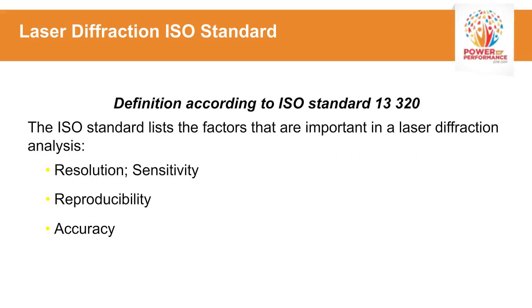Brief discussion on ISO standards. ISO standard 13320 discusses some key factors that are important for laser diffraction that one wants to consider in their design. ISO took these into consideration. So resolution and sensitivity of the result. In other words, you want to be able to resolve different sizes easily and also be able to sense small changes in a particle system, if the distribution is changing, be able to see these readily. Reproducibility, of course, is very important. And then accuracy of the results. And we'll discuss these in more detail later in the lecture.